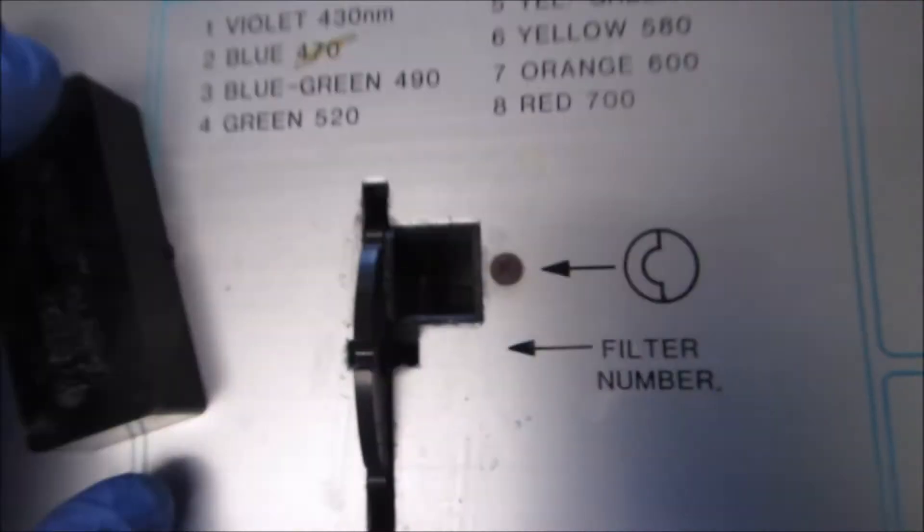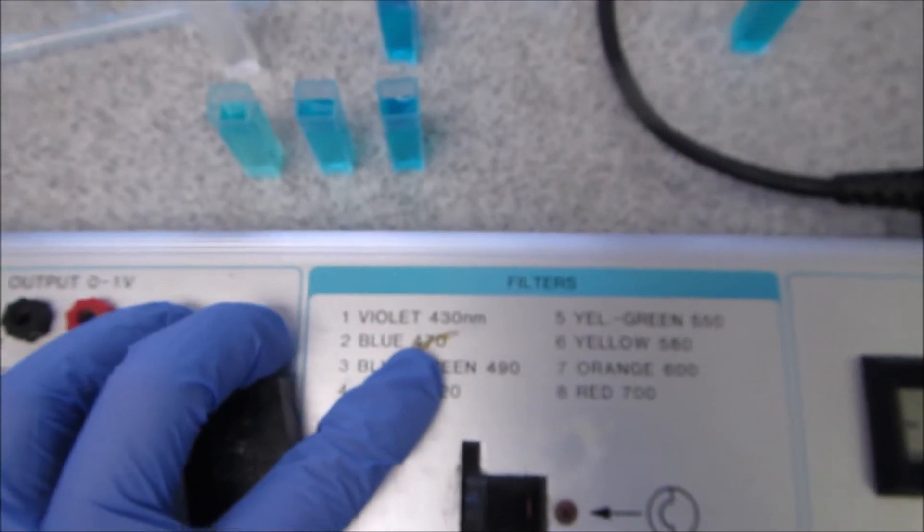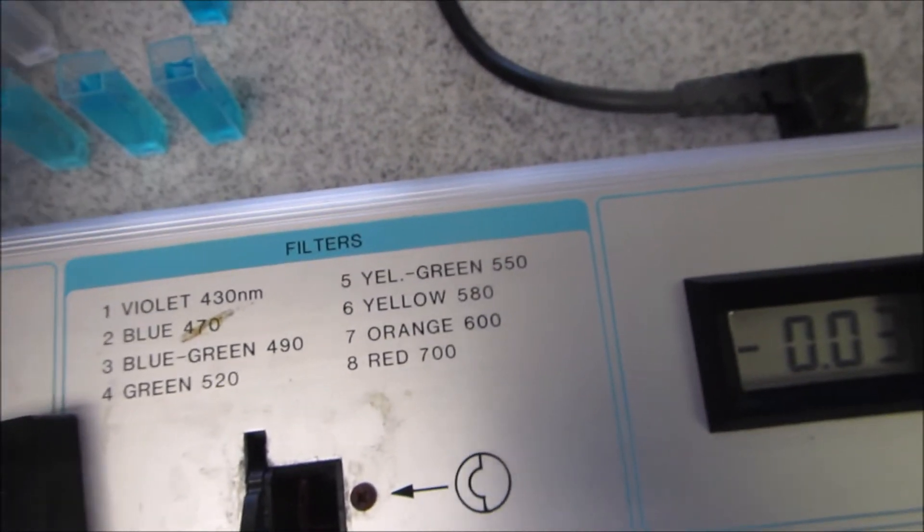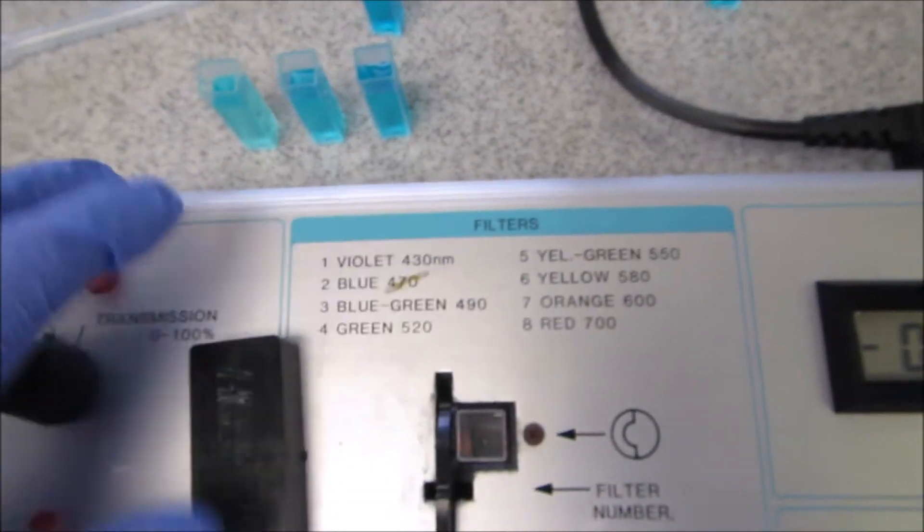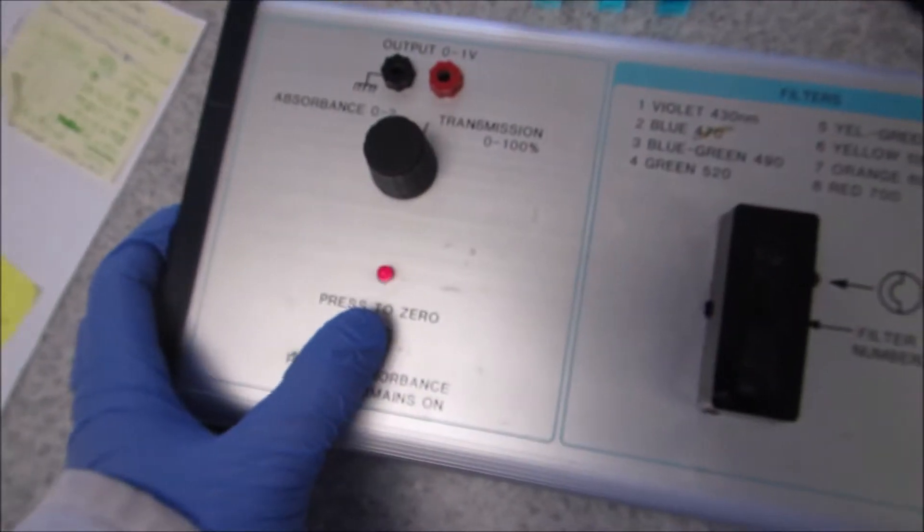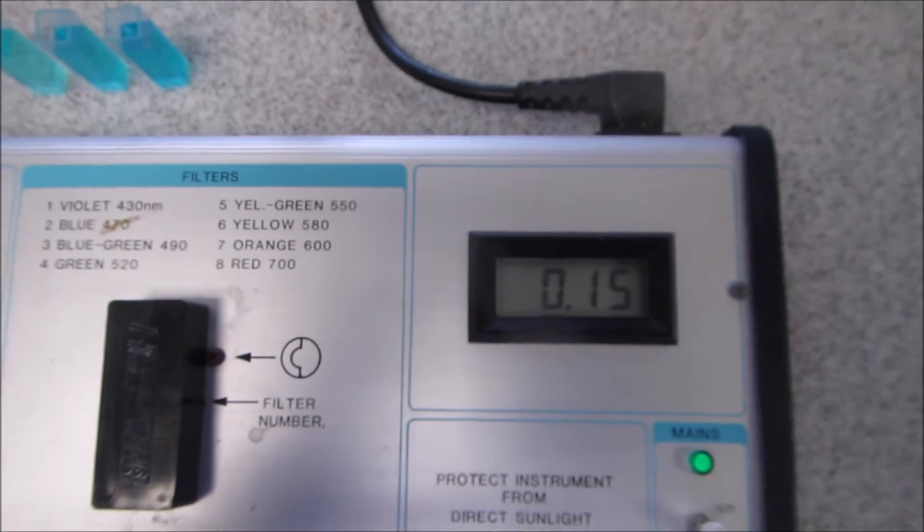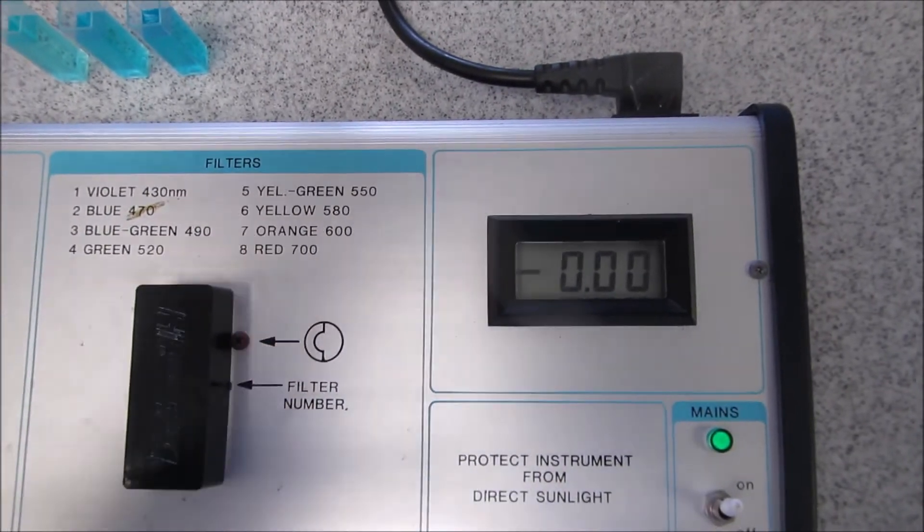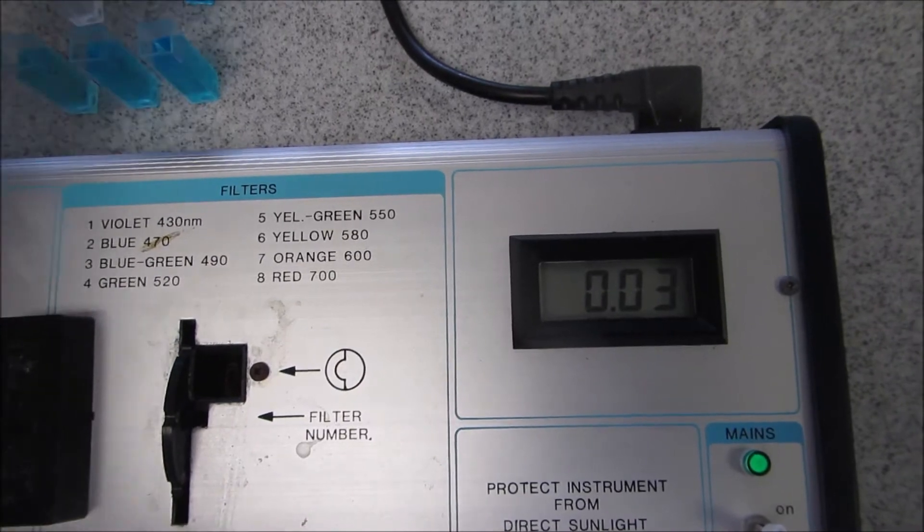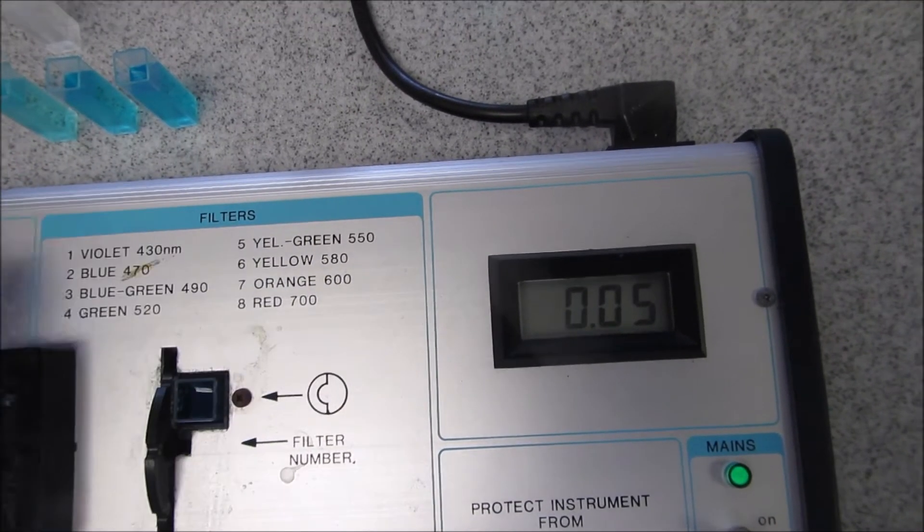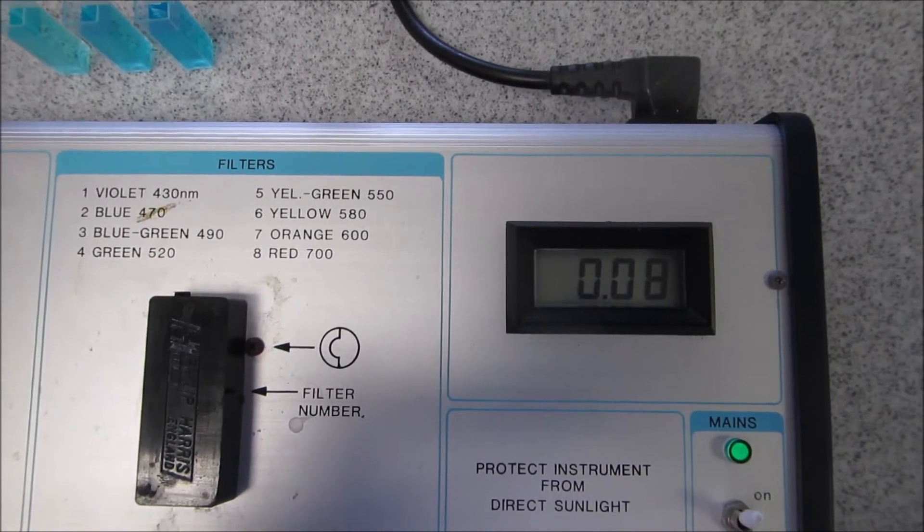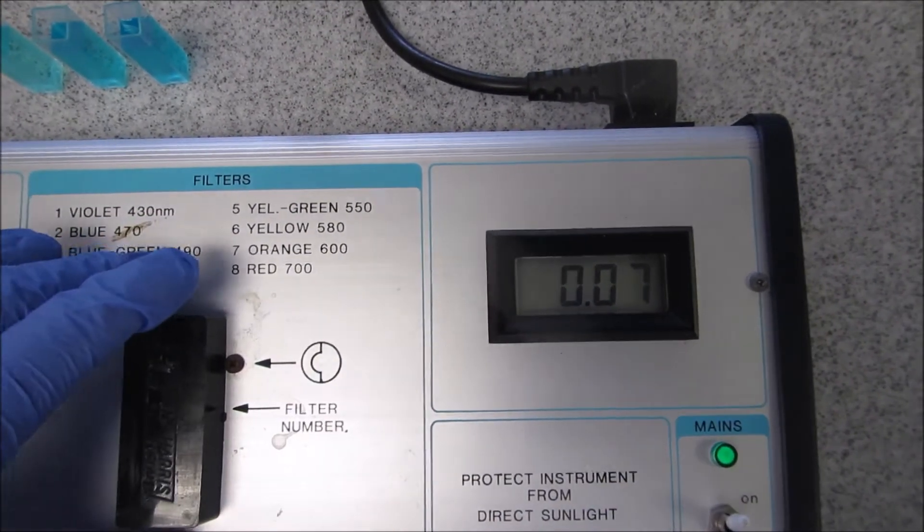We're now up to wavelength 2, which is 470 nanometers. I'm going to put in my blank, the deionized water, cover it, and press to zero. Once it's come down to zero I'll take out my blank, put in my 1 molar copper sulfate solution, and again you can see the reading. It's still fairly low.